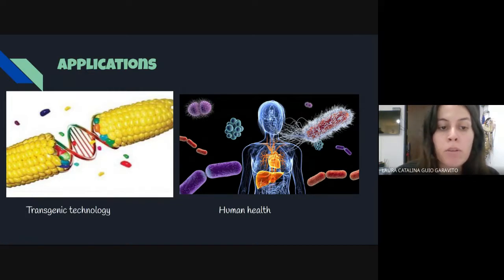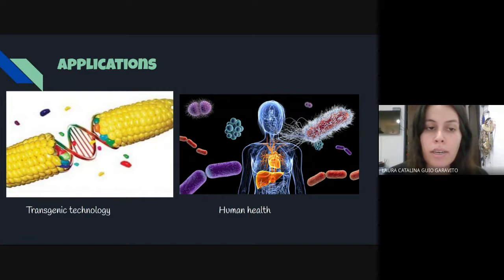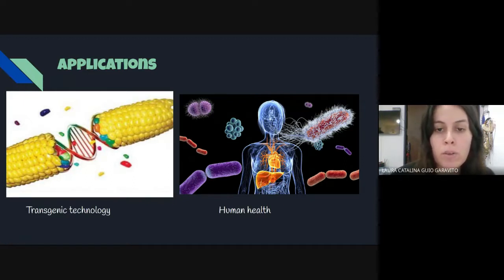The most popular application is human health, because this technique is used in the study of cancer and similar diseases and clinical health, and in some studies for examining the microorganisms in the body.